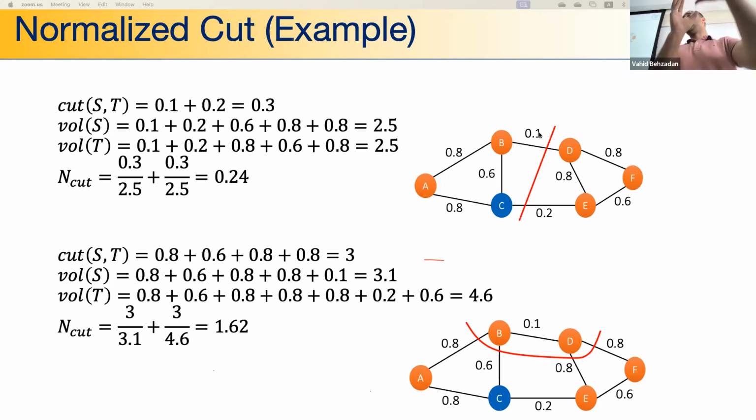So if you have an imbalanced data set, you would expect the cluster with few samples to not be connected to as many cells as the cluster with many cells, right? So you would find a weak connection between the two. And it should be, yeah, I think, yeah, go ahead.